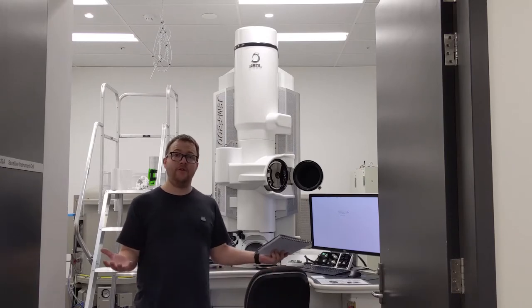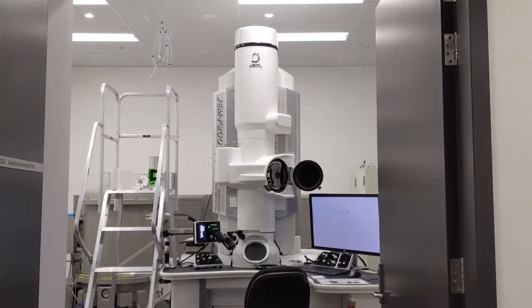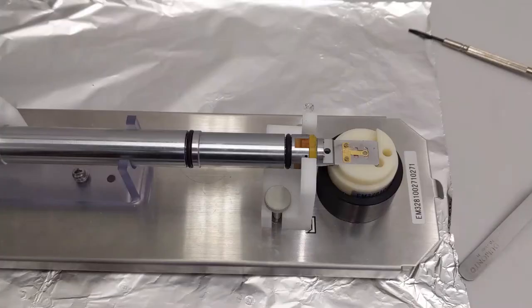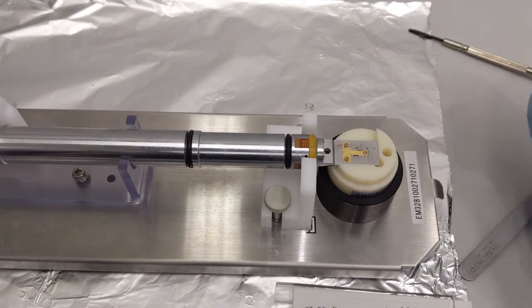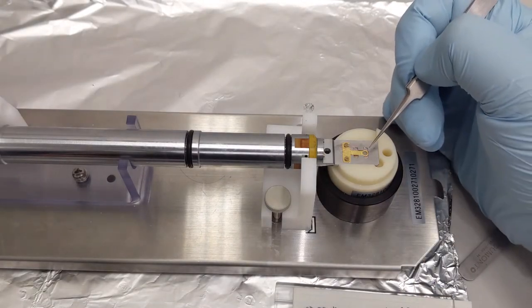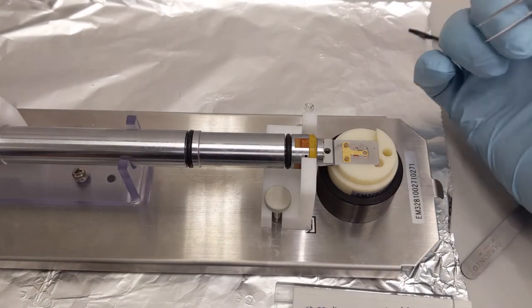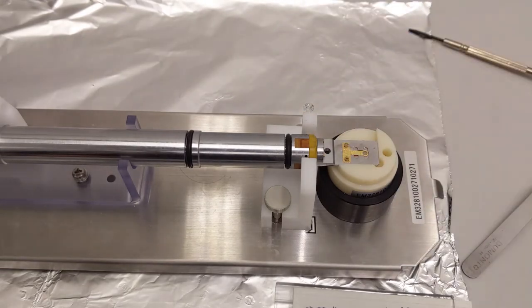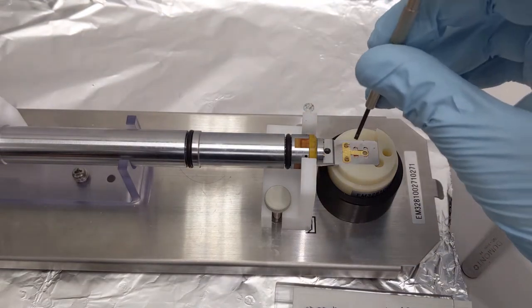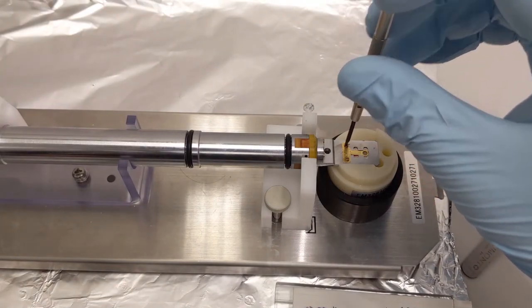So let's get the sample in the holder. This is the sample holder, which we're going to put the sample into. The sample sits in this region here, and is held down by this clamp. The whole holder goes into the vacuum of the microscope, and these two O-rings seal off that vacuum. So we release the clamp using these two screws.